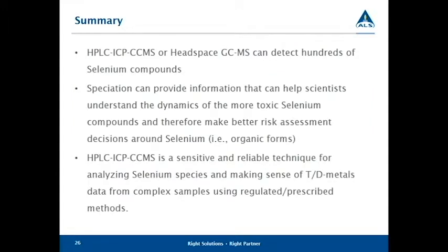So just in summary, I hope I've demonstrated that HPLC-ICP-MS and headspace GC-MS can detect many common selenium compounds, but there are still some unknowns. Speciation can also provide invaluable information to better understand bioaccumulation and trophic transfer, and to allow better risk assessment around selenium. And speciation can also be an invaluable tool to highlight some compliance issues associated with some of the regulatory prescribed methods, specifically around total and dissolved selenium and metals analysis. So thank you very much for your attention.